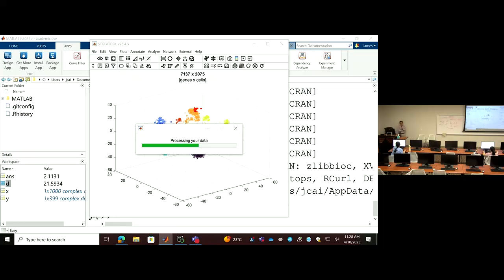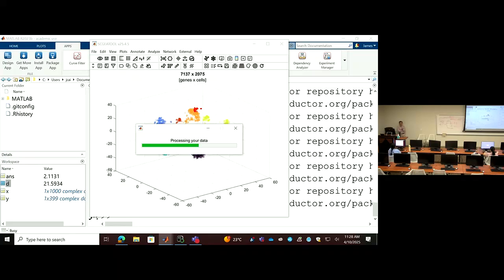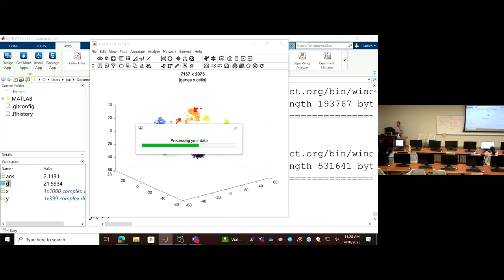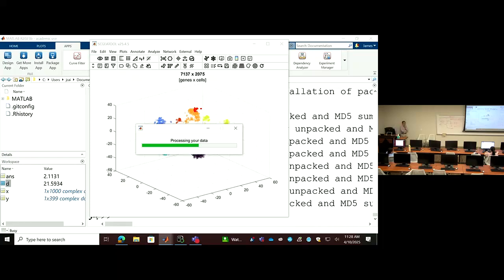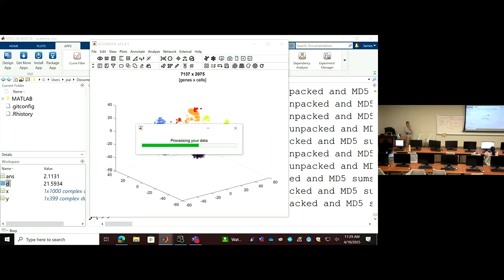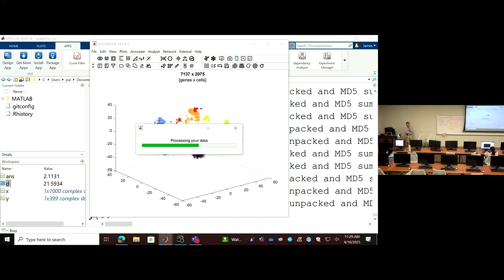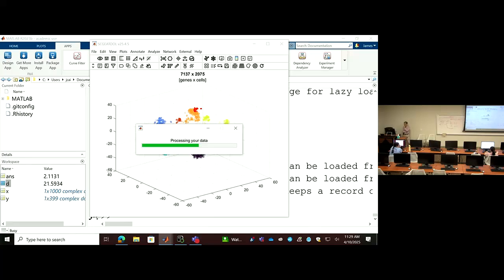I just try to run Monaco directly from the interface to see whether I can get some luck with the program installing itself. Because I couldn't install Monaco from reading the installation instructions in R, so I just tried to run this here directly.